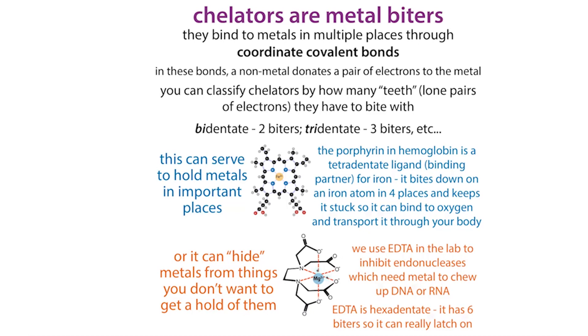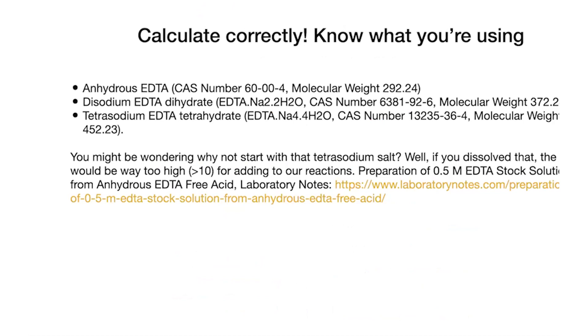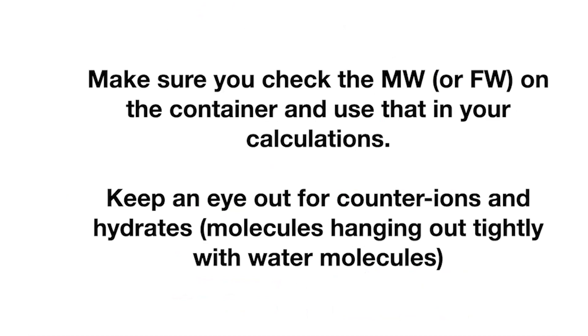The most important thing to take away lab-wise is that you need to be really careful and use the right concentration when doing your calculations. Check the label of the bottle you're using to make sure it's what you actually think it is. Often it's not a big deal if you're dealing with a trihydrate or a tetrahydrate, since you might have different numbers of water molecules, but the key difference is going to be in what the formula weight is. Look at the bottle and see what the molecular weight or formula weight is listed there.